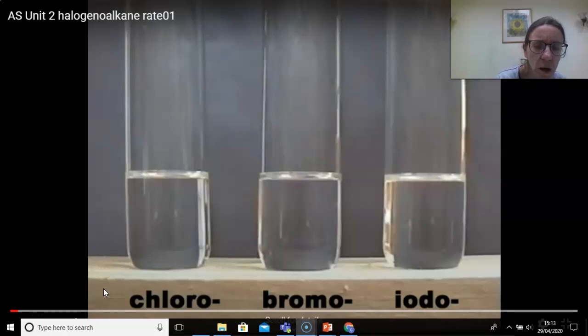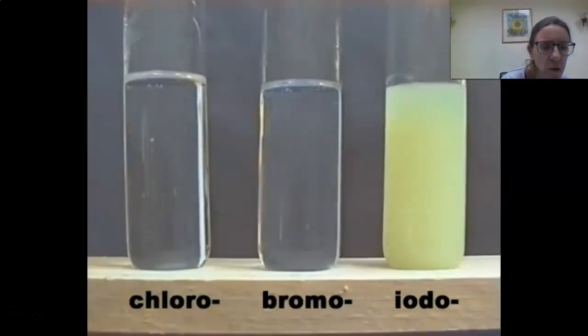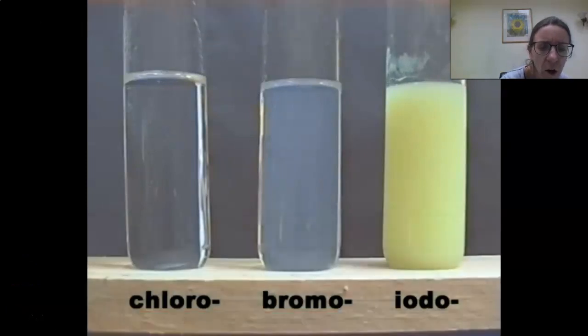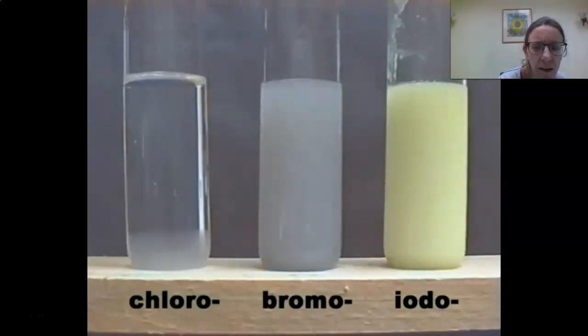If you go onto the PowerPoint, this is one of the videos that we point you to. But you can see there, as we add the silver nitrate, the iodo changes almost immediately. The chloro and the bromo, you can just start to see that the bromo is starting to produce a precipitate. It's going a little bit cloudy. That one's quite a slow reaction. The iodo one happens almost instantaneously, but the bromo is quite slow. But you can see there clearly it is starting to form a precipitate, so it's coming second. So iodo was the first one to form precipitate, then bromo, then chloro.